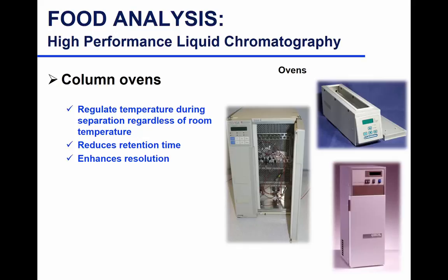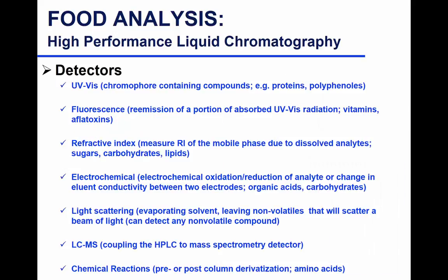Column ovens. Oftentimes you put your column in an oven to regulate temperature, and we talked about how that helps with the resolution and the viscosity of your mobile phase. So, already discussed, it enhances retention, reduces retention time, enhances resolution, and makes your analysis faster, so that's great. Column ovens are great.